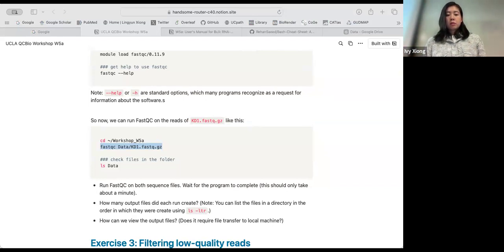I also like the history of them. Yeah, try that. Wait, my H doesn't work. Oh, you have to specify the alias in your bash profile file. So we're doing this for both KD1 and S.